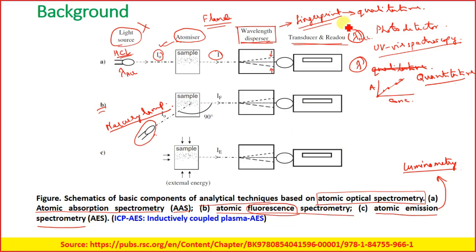However, if you see this one, there is a light source, and here you are exciting with a particular wavelength and then analyzing the spectrum.